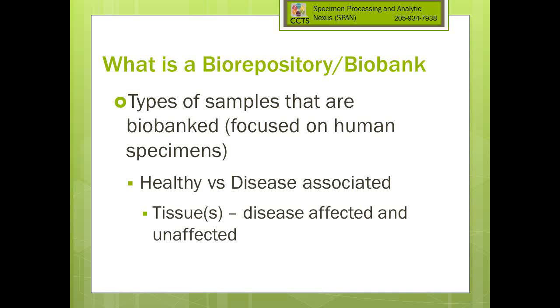So before we get into it, I'd just like to review three different types of specimens and what the UAB resources are for working on these types of specimens. Obviously in all of this, I won't make a distinction between a biospecimen from a healthy individual or a patient with a particular phenotype or disease. They're biospecimens, and obviously the type of information associated will vary depending on whether it's a healthy person or a person with an autoimmune disease or whatever. But I think the basic guidelines for building a biobank are really the same whether it's healthy or disease.